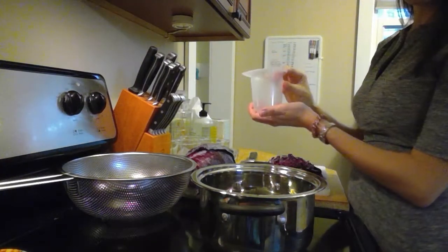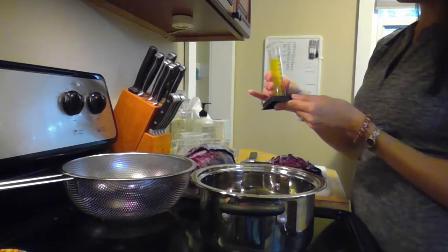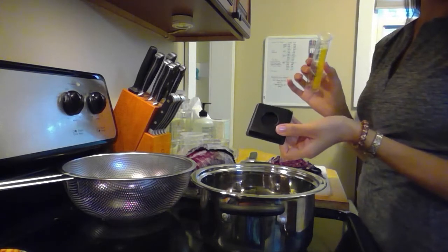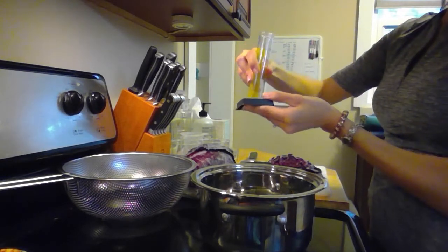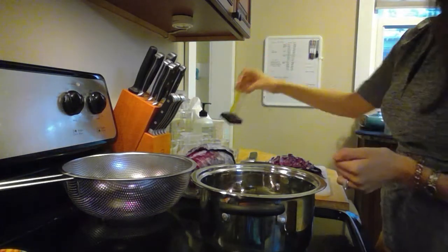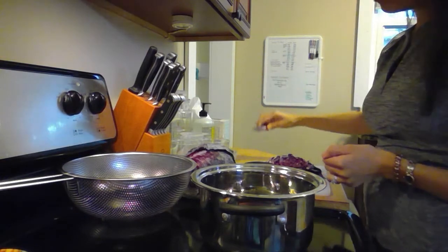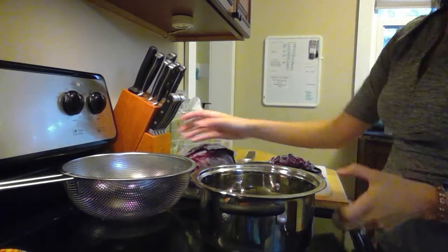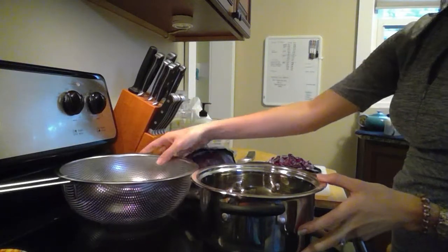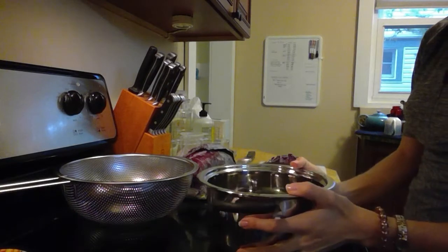I have a beaker from our lab kit. And I also have this lovely measuring tube here. Remember that you have a base with it in your lab kit as well, and it will just pop straight down so that you can stand it up on the table. So you'll need this, you'll need your glasses, you'll need a knife and a cutting board to cut up your red cabbage, and then you might also either want a colander or some kind of slotted spoon, salad spinner maybe could be used, and you'll need a pot for boiling.